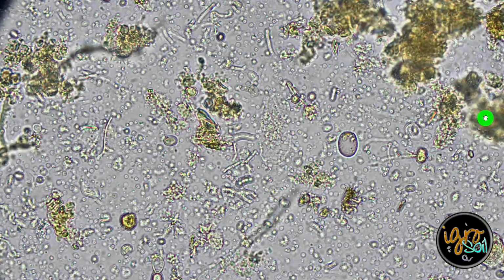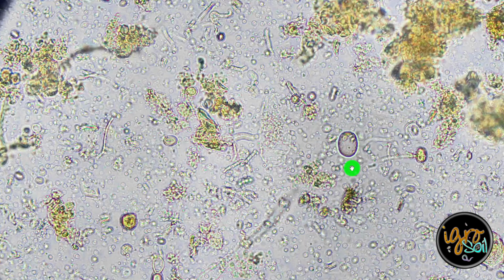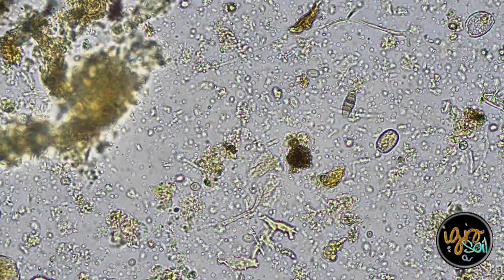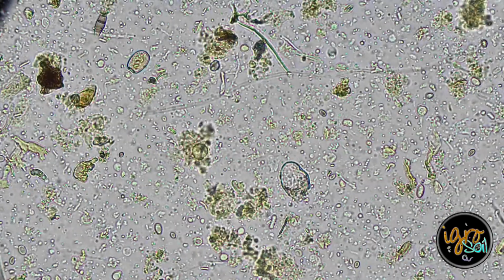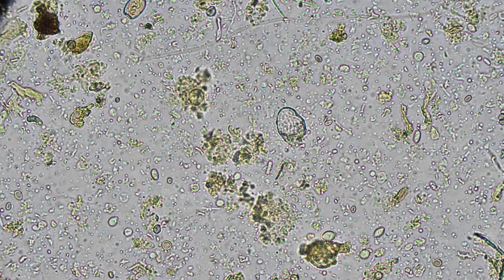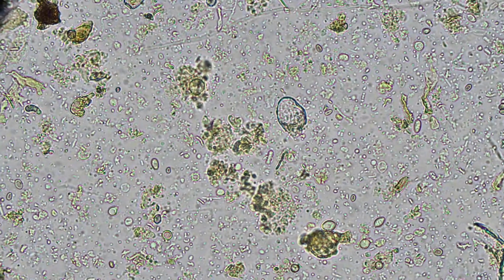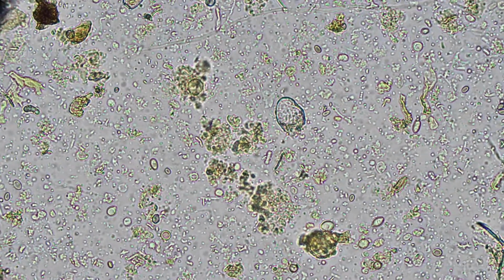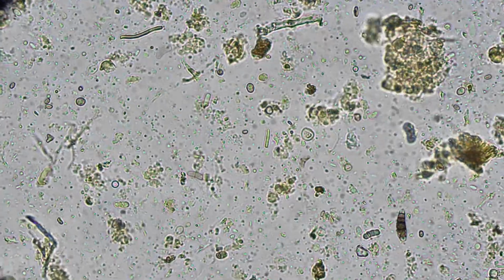More amoeba, and then there's a diversity of testates in here. Look at this one, right? So I'm always looking for diversity. You know, from one block to the next, that can just change things. Going back to the stuff we can't see, like phytohormones, auxins, cytokinins, all the stuff that triggers gibberellins and seeds. Very much like the worm castings.